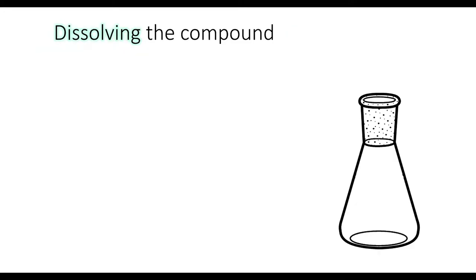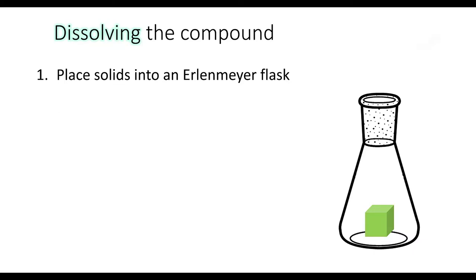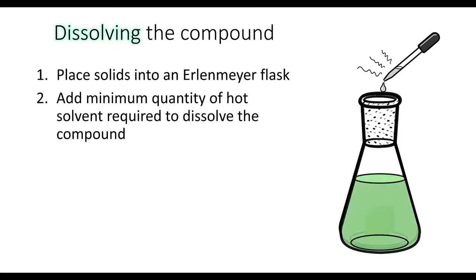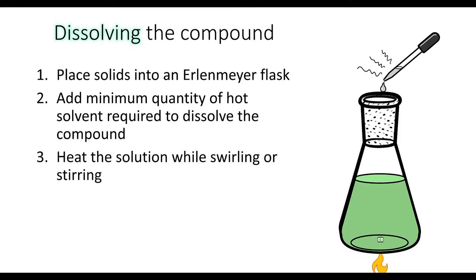Now let's go through the steps of dissolving the compound. First, we place the solids into an Erlenmeyer flask. An Erlenmeyer flask is preferred because it has a more narrow neck, so if the flask tips over, most of your liquid is going to stay inside. Then we add the minimum quantity of hot solvent required to dissolve the compound and heat the solution while swirling or stirring.